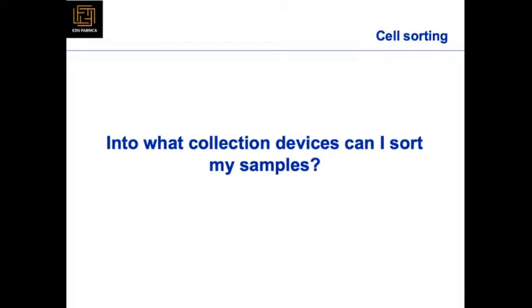So into what collection devices can I sort my samples? You can use a 6 well plate, 8 well plate, 12 well plate, 96 well plate, 384 well plate, you can use any well plate as per the samples you are looking for.